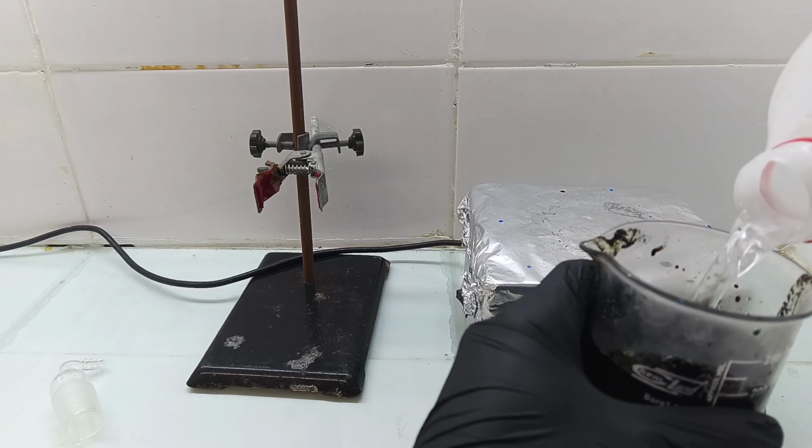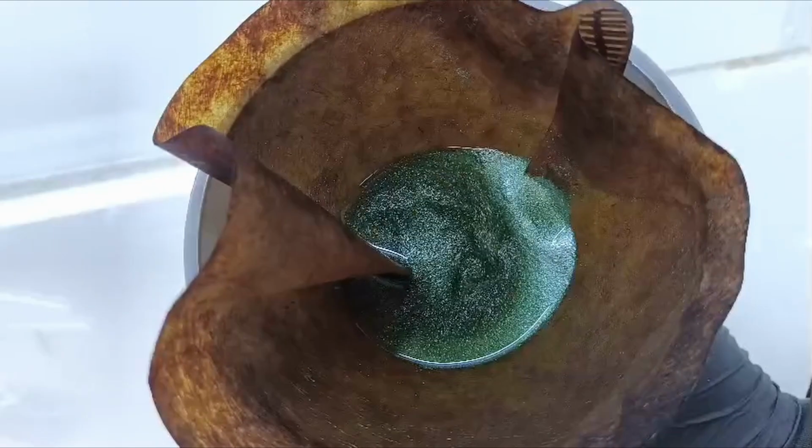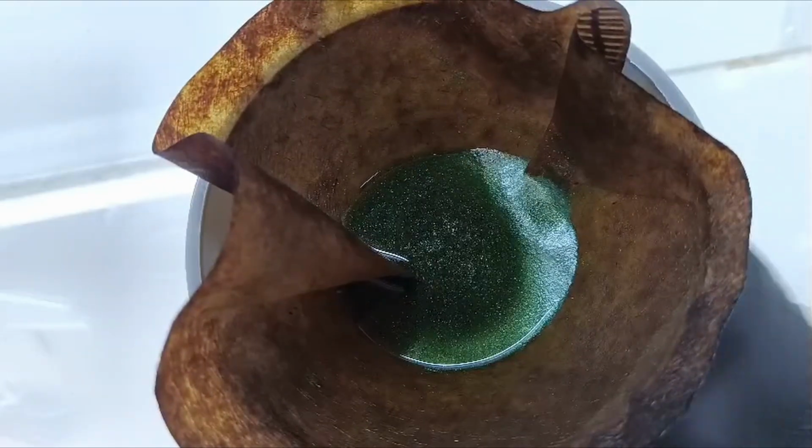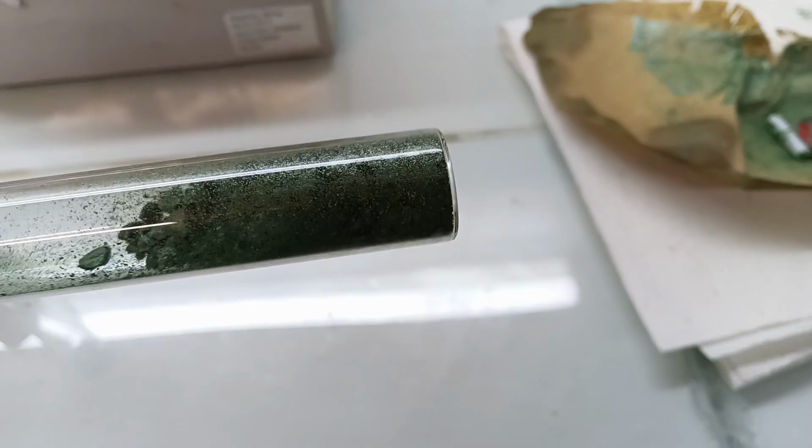Next, I added some water to the black sludge, filtered the product and washed it with cold water a couple of times. The extremely shiny, bright green crystals were then dried on the filter and put into a vial.